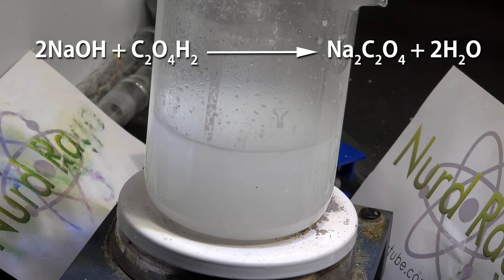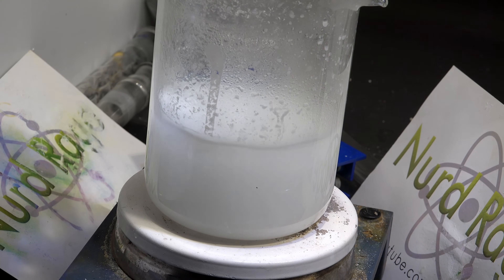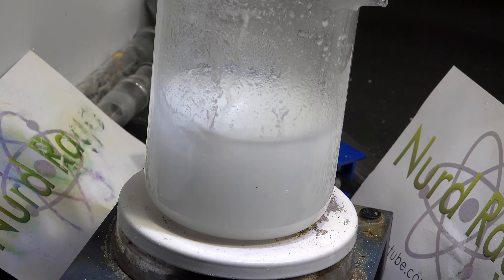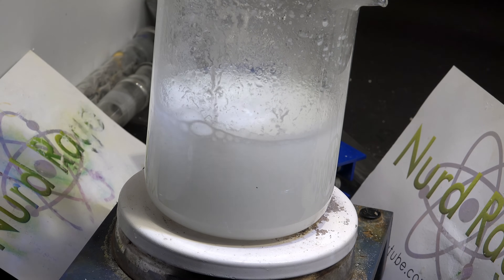What's happening is the sodium hydroxide is reacting with the oxalic acid to make sodium oxalate. Sodium oxalate has low solubility in water, even in hot water, so it instantly precipitates out. This makes sodium oxalate very easy to prepare and purify for the amateur chemist. Most of the impurities in the oxalic acid and the sodium hydroxide would remain in solution.